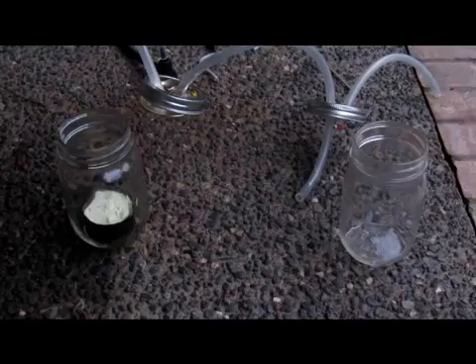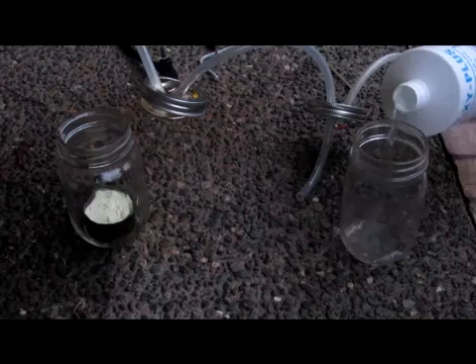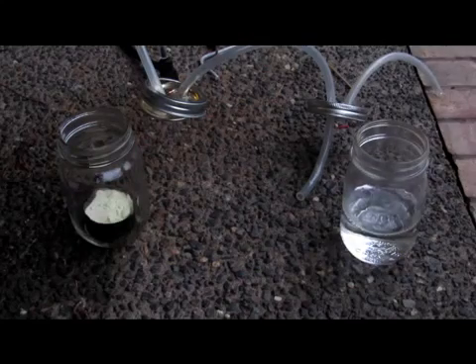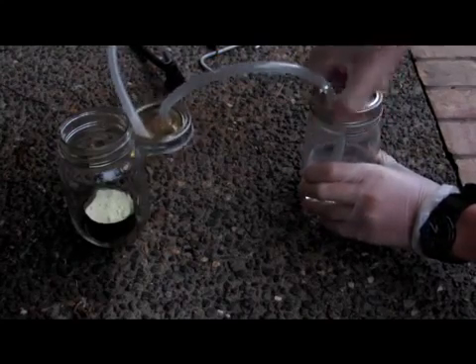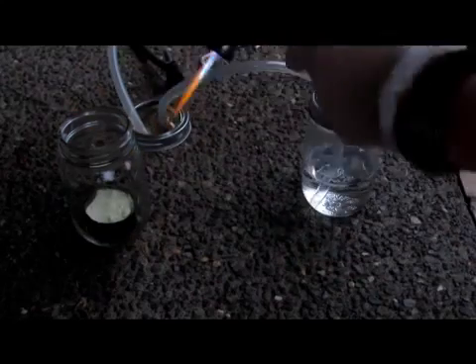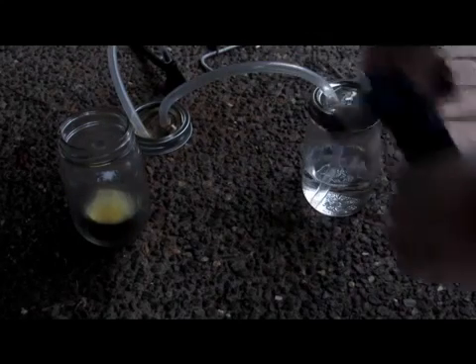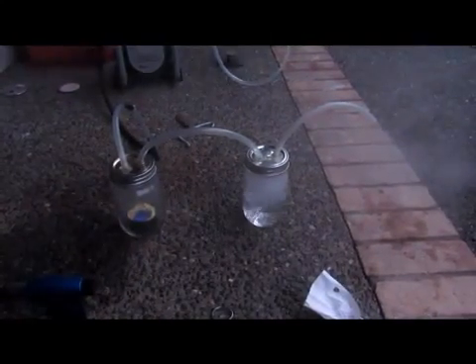We're going to fill this up, stick our sulfur in there, go outside, and see if it works. So now let's fill up this jar with some hydrogen peroxide. We'll just put some in and then screw on the top. And then we'll light this off here, and hopefully we should get the sulfur starting to burn. Sulfur is not easy to ignite. Now you can see the reaction's working. We got the sulfur burning over there and bubbling through. We'll leave this until the sulfur's done burning and then come back.